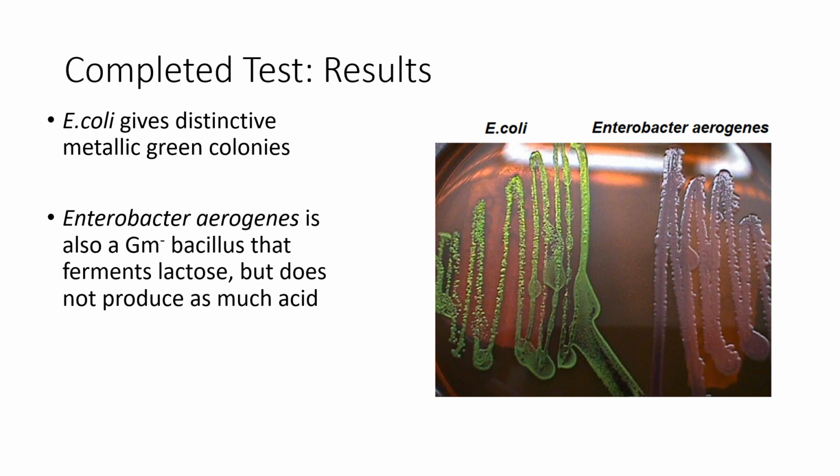And the typical other organism that you might find is Enterobacter aerogenes. Now, Enterobacter aerogenes is one of the 8 organisms that I would have given you in the unknown. And this reaction on EMB is something to take note of, because you might get as your unknown EA, Enterobacter aerogenes, which would have passed all the way through the coliform analysis, but here, oops, it's not E. coli, right? It's different, but it is a result that we can work with and we can remember.